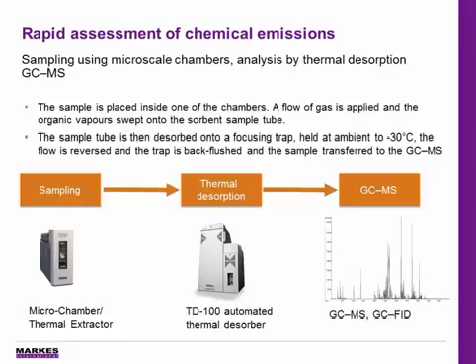These long protocols for certification create a need for rapid assessment, both for the manufacturers to understand how they can comply with these different regulations, to reanalyze their formulation, to do troubleshooting, and to screen and predict how these materials are going to work. Also, test laboratories like to pre-screen their materials before submitting for a long-term test.